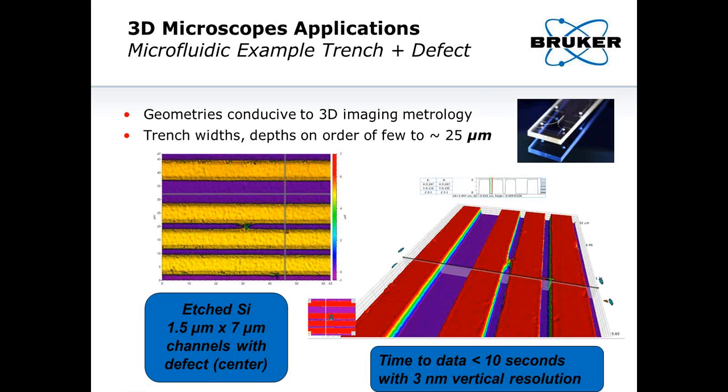This is an application where a laser scanning system could also do the job, but you wouldn't necessarily come to 3-nanometer vertical resolution and may not be able to do it so quickly. So there is a capability that is offered by this type of a technology that is very useful for a variety of applications.